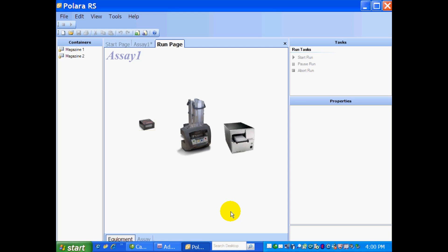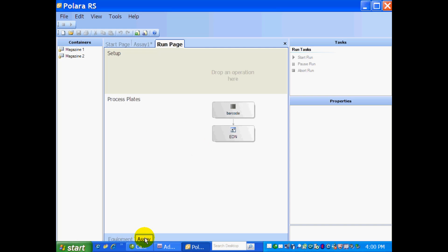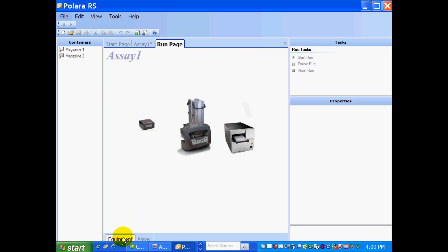So in the background, I have my RapidStack homing, and establishing communication to the instruments. You can see that we have a view of the Equipment tab. I can toggle back to Assay tab, and I'm going to stay on the Equipment tab.